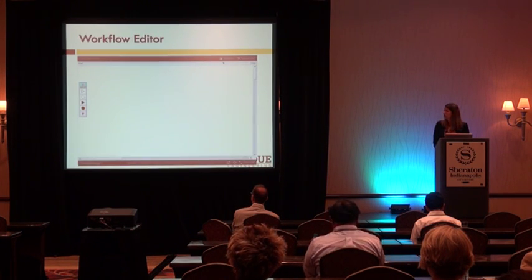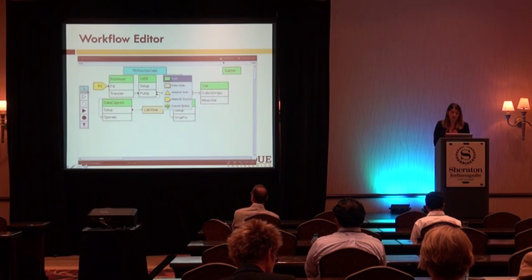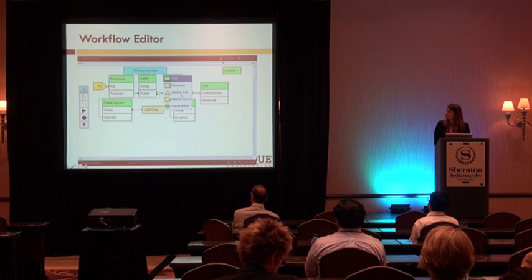So this is how the workflow editor looks. First, you only have 6 icons. The first blue icon is the workflow icon. If you click that, you will get the blue box, which says TB3 nozzle calibration workflow in this example. So this will represent your workflow. And then if you click on that, you will get this menu, where you can select task, data node, material sink, or material source, and the submit button. And then you can build your experimental workflow.